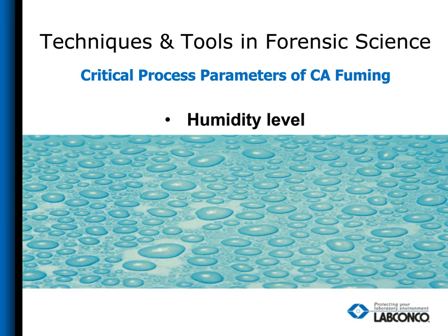Another area that is pretty consistent is humidity. Throughout the world, depending on extreme geographical locations, usually 70 to 80% humidity during the fuming process is optimum for consistent latent print development on all types of evidence from semi-porous to non-porous types.